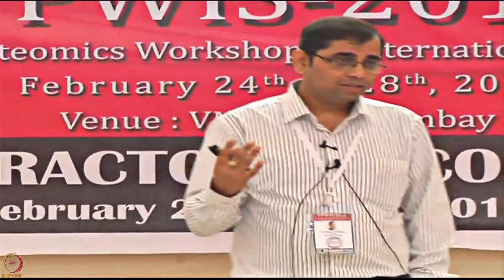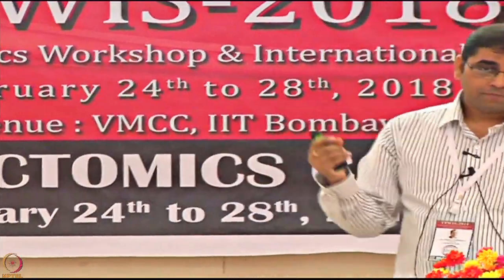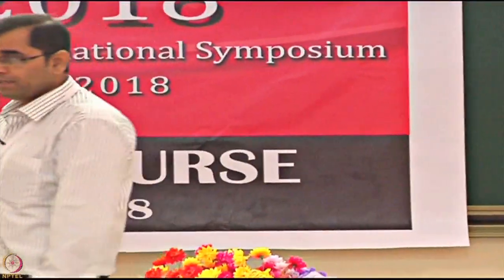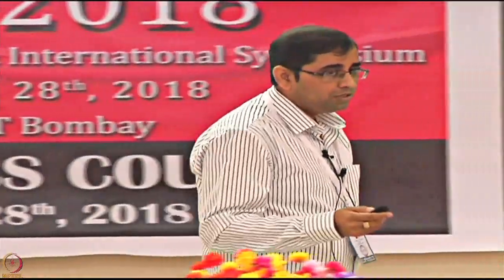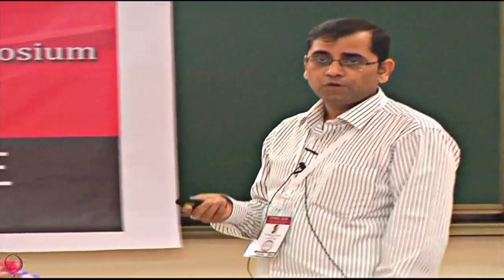The same thing is applicable here on the SPR-based platforms, where you can do only a maximum of 4 interactions, or 4 binding tests, on the Biacore kind of platform, versus thousands on a different platform. And that's where the concept of SPR imaging became very powerful, with the hope that we can build platforms that do high-throughput interaction studies using the same principle we have used for SPR.